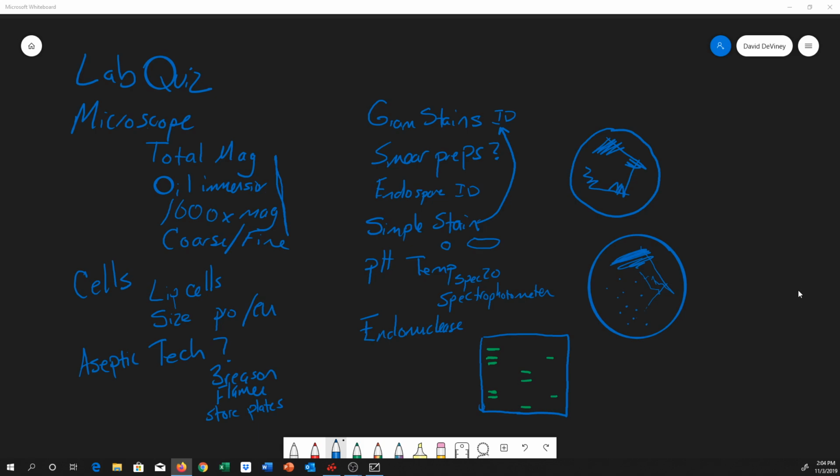Oh, so we just finished in lab the transformation lab. So even though you won't be able to see your results yet, what I'm after there is just general stuff. So what are you looking for? What was the transformation? How would you know if you had successfully transformed the bacteria or not? What is it we're looking for? And those should all be questions that you should be able to answer without actually seeing your results, and whether or not these actually end up working, that's another issue.